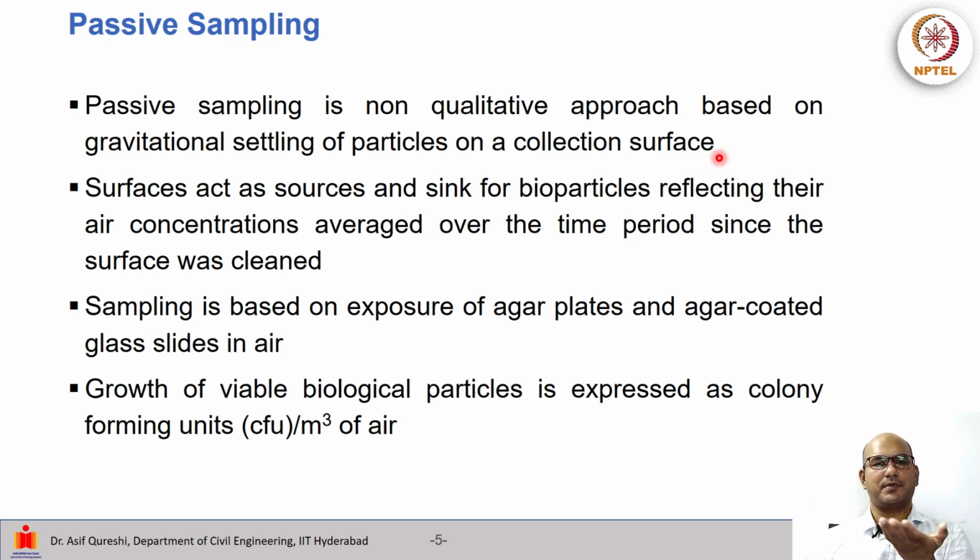So it can be just like a plate and the things are depositing on the plate, and then we do some counting. In this particular method, the surface of the collection plate will act as a source of bioparticles, reflecting their air concentrations averaged over the time period of sampling.